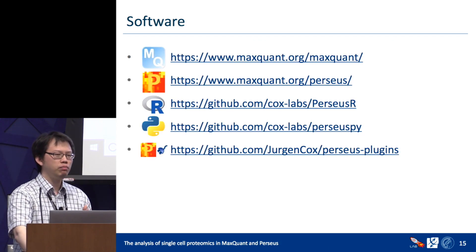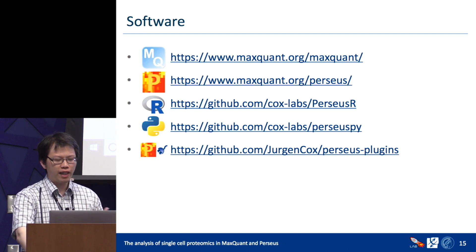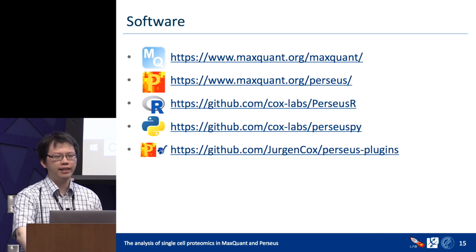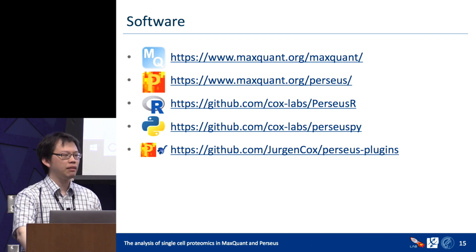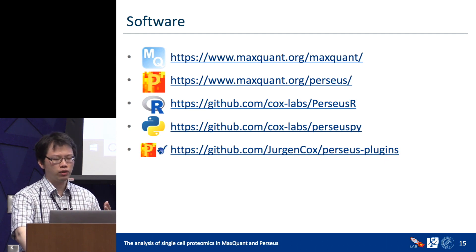Now I want to show you how to do the analysis using MaxQuant and Perseus. First, you need to download the tools. MaxQuant and Perseus can easily be downloaded from the provided URL. If you want to run packages or plugins integrated into Perseus that use R or Python packages, you need to download PerseusR and PerseusPy. If you want to create a plugin yourself, you can download the Perseus plugin and write your own code in R or Python and integrate it into Perseus — it's quite flexible.